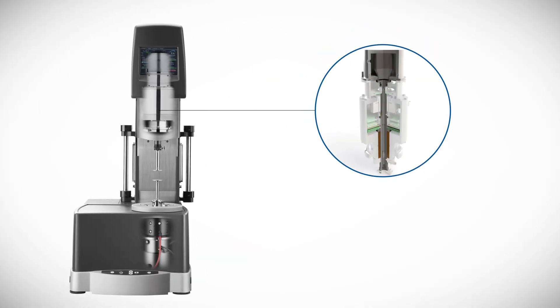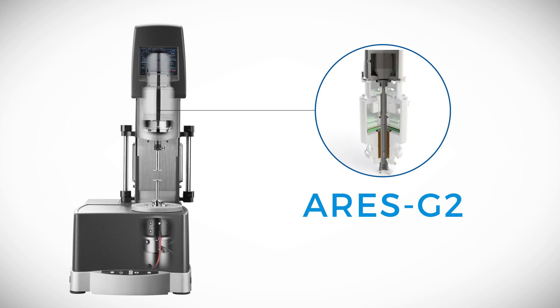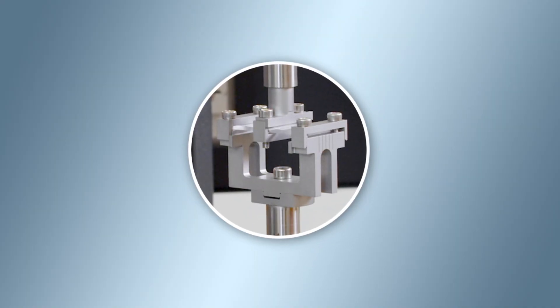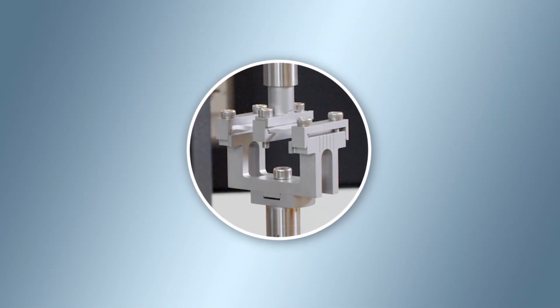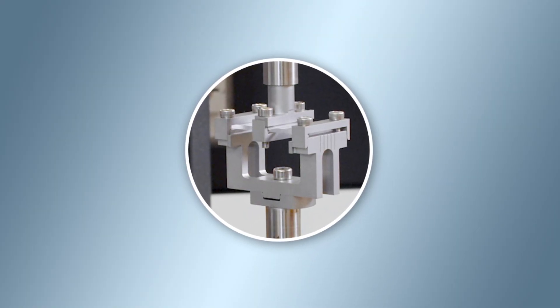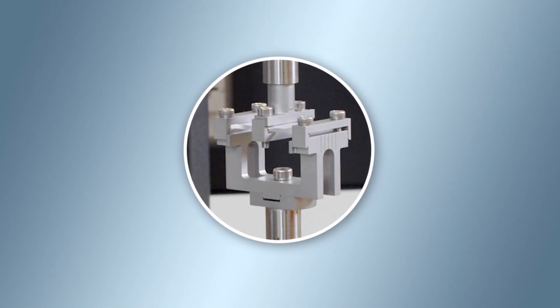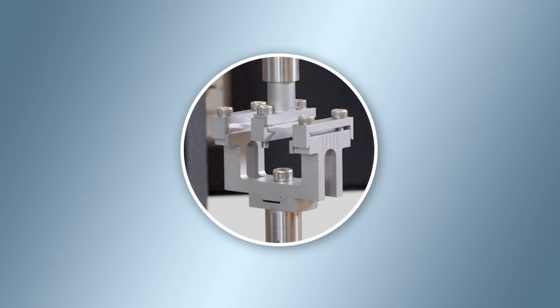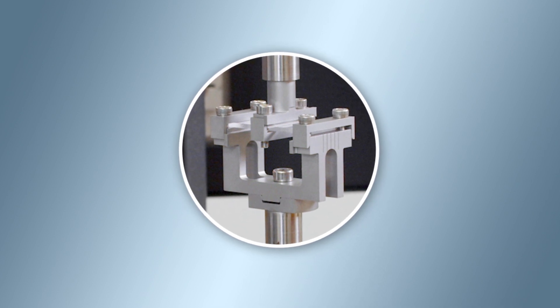Using the force rebalance transducer, the ARES-G2 is a rotational rheometer capable of performing linear dynamic mechanical analysis. The cantilever clamp can be used to study viscoelastic properties of a solid rectangular specimen in bending mode.